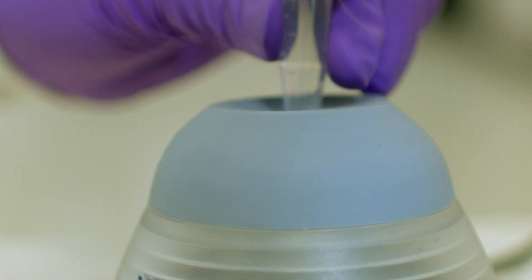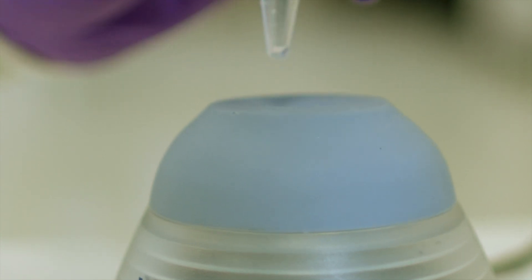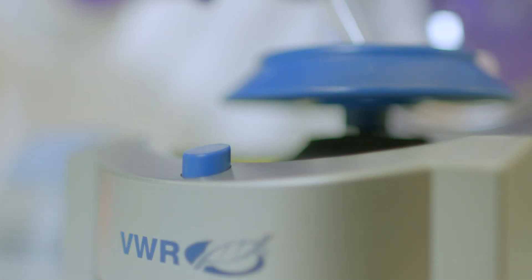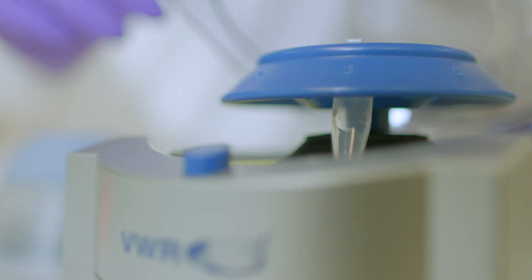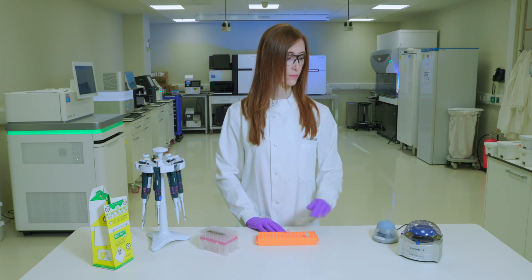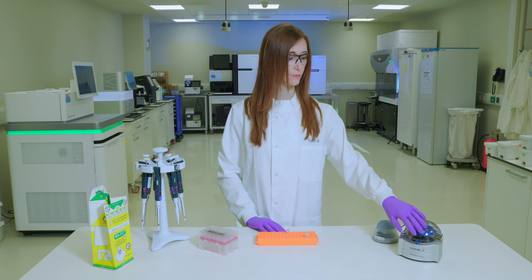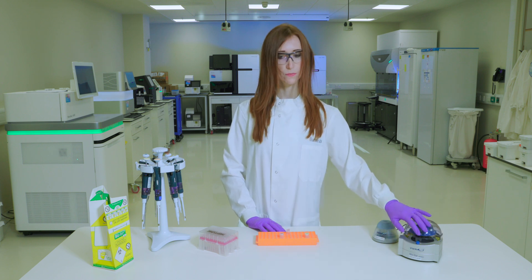We will now use the freshly diluted NaOH to denature the PhiX control. Take a microcentrifuge tube and combine 5 µL of 0.2 normal NaOH with 5 µL of diluted PhiX library. Vortex briefly and then centrifuge at 280g for one minute. Incubate at room temperature for 5 minutes.